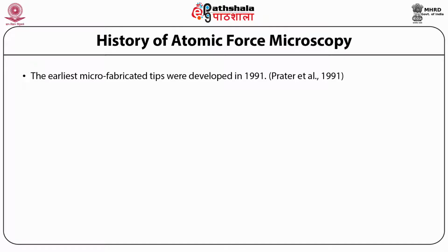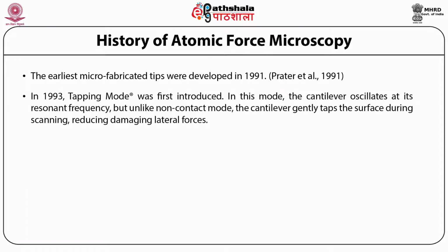In 1993, tapping mode was first introduced. In this mode, the cantilever oscillates at its resonant frequency, but unlike non-contact mode, the cantilever gently taps the surface during scanning, reducing damaging lateral forces.